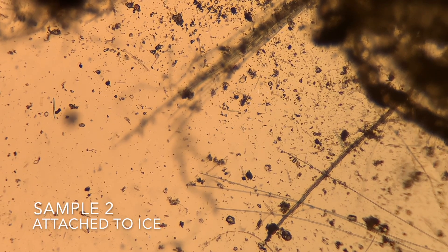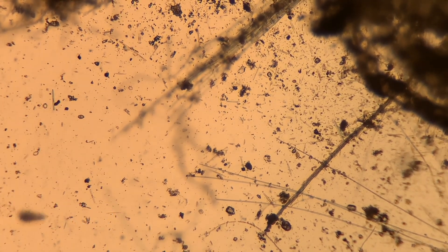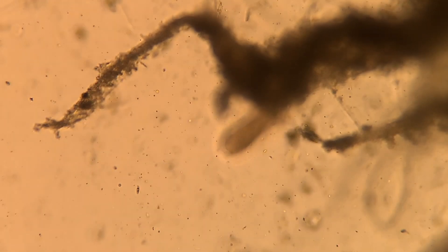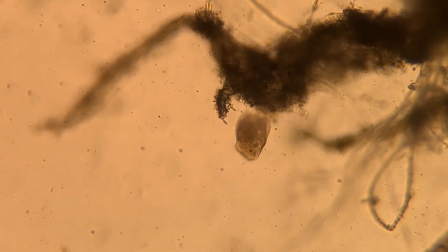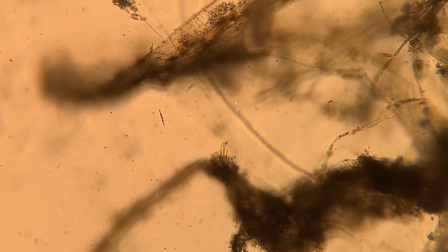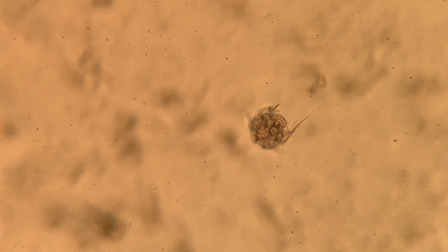Next up is our sample of stuff that was attached to the ice. In this one, we definitely saw a lot more living things, like this little guy. I'm not sure exactly what it is, but it looks like a red bell pepper to me. It's definitely some kind of rotifer — you can tell by its head.